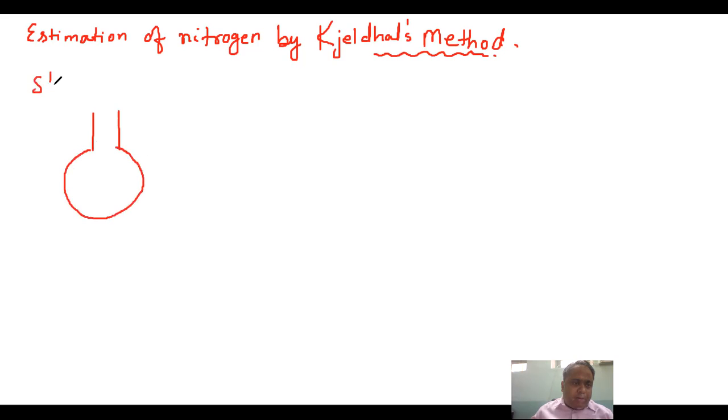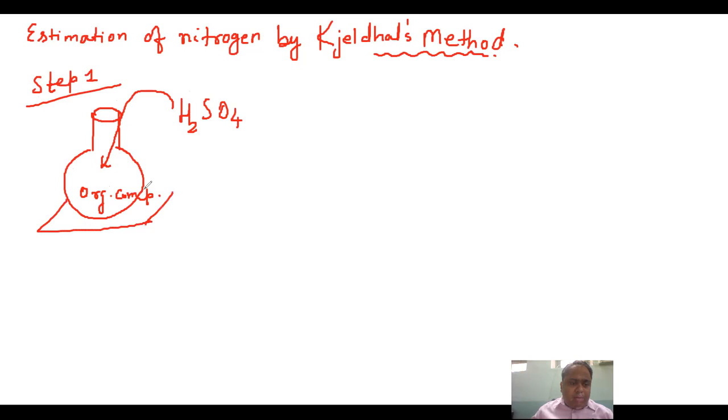Okay, step 1. To this we put H2SO4 and we warm it or reflux it, means allow it to evaporate and condense.